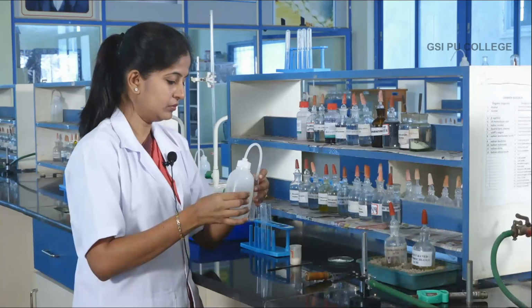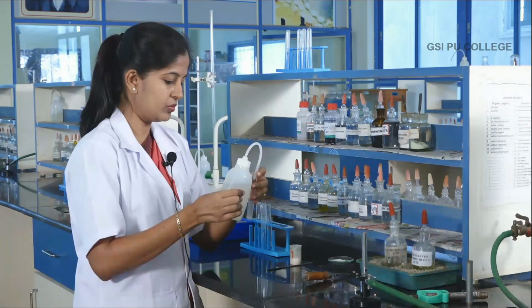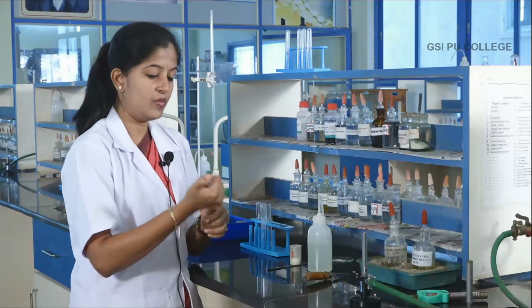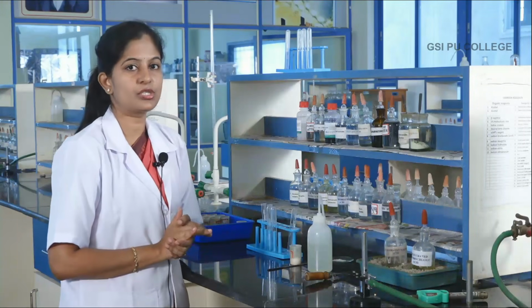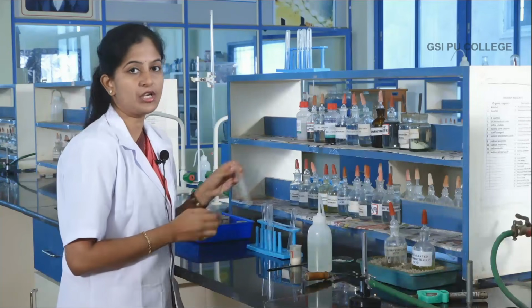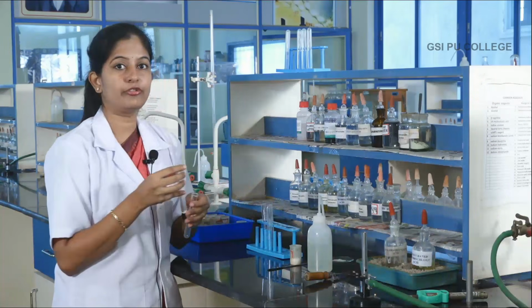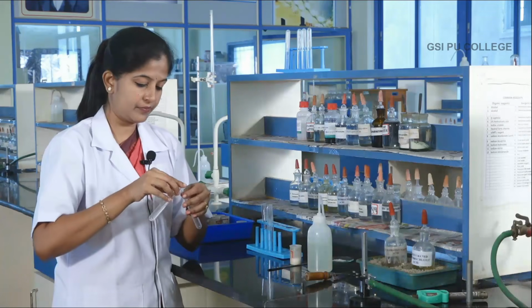so that a concentrated original solution is prepared. Add some water, say 3/4 of the test tube, and prepare your original solution. Now, the original solution is prepared. So, we will start the analysis for the first group basic radical. Decant a small amount of the original solution prepared.